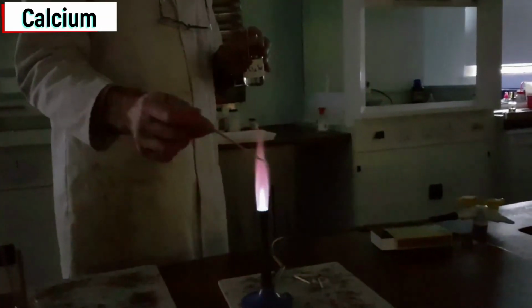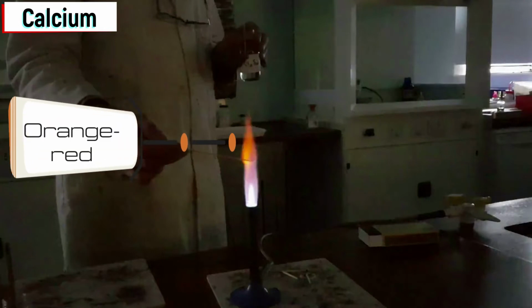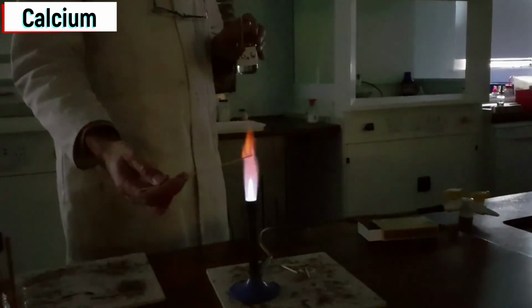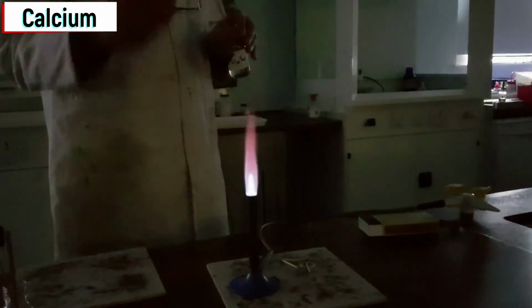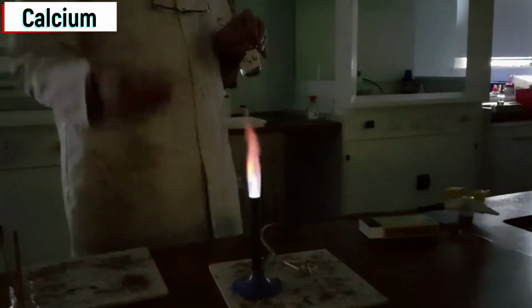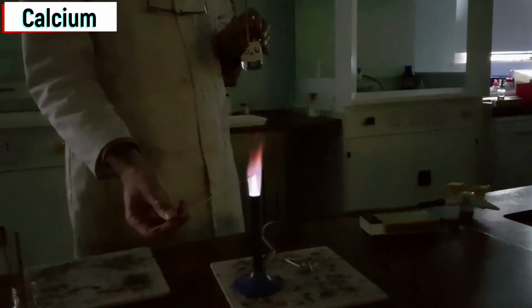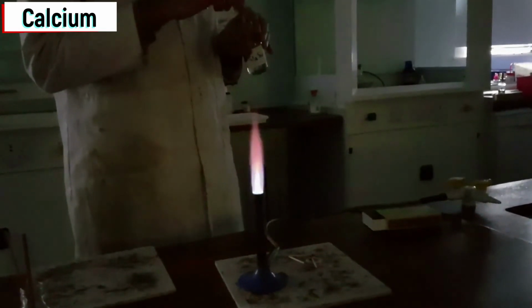The fourth one here is calcium, sir. Calcium. And calcium there giving another orange flame, but actually a slightly different colour to the sodium.